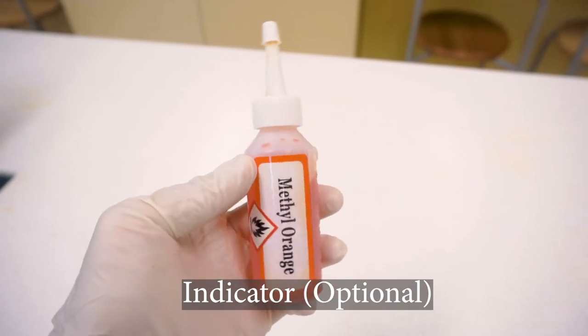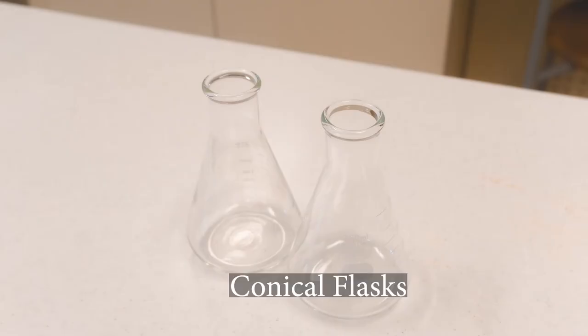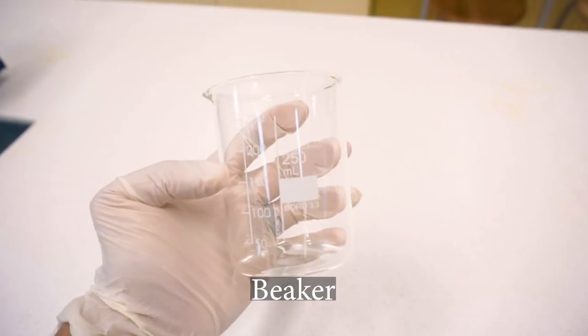Indicator. As for glassware, you will need a conical flask and a glass beaker.